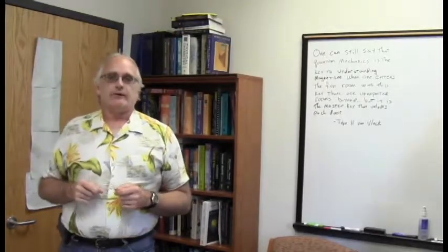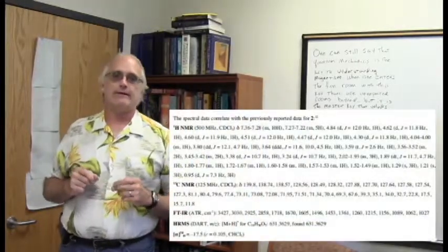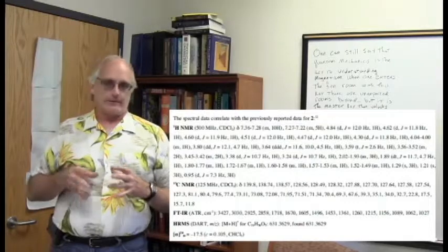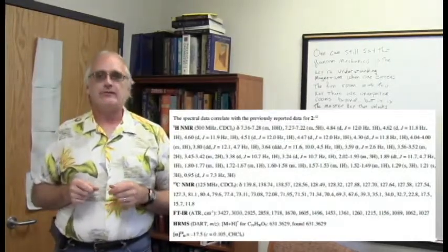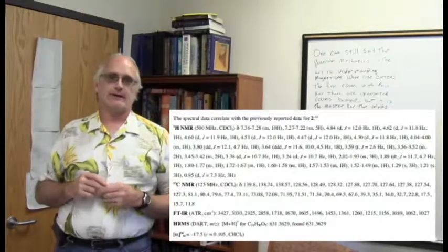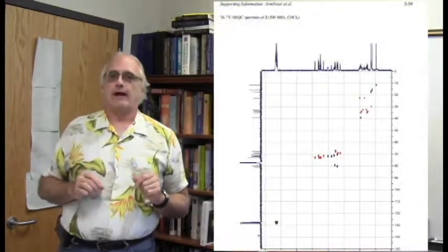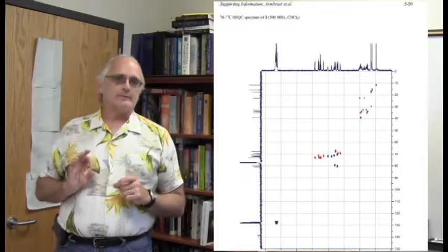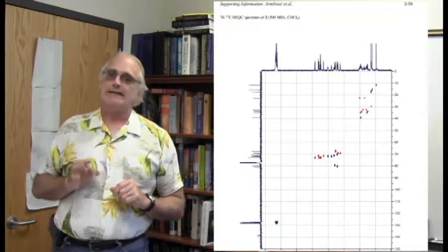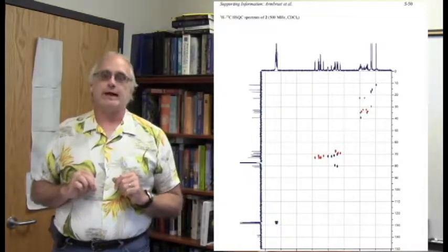The other characterization data, yes, you do have all the protons and carbons assigned here. Oftentimes they give you all the spectra, but they'll also summarize it in these long lists of text. Here's what this stuff looks like. I'm going to go back to the HSQC for a moment just because it's prettier to look at. And I do want you to realize, as we've said a few times already, living, breathing quantum mechanics. No, I didn't forget about our friends, the P-chemists and the physicists. They're in this game too.